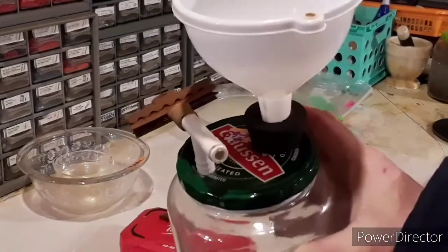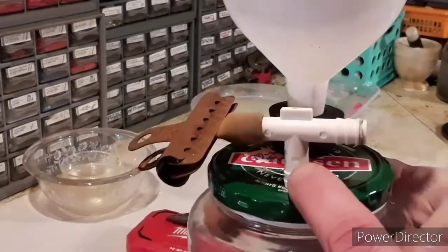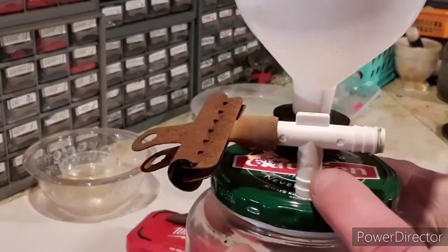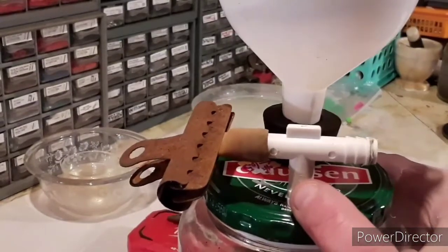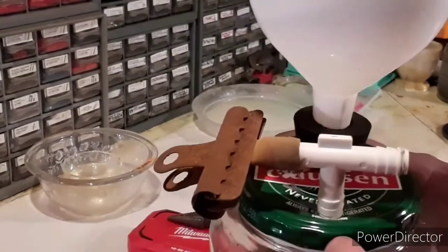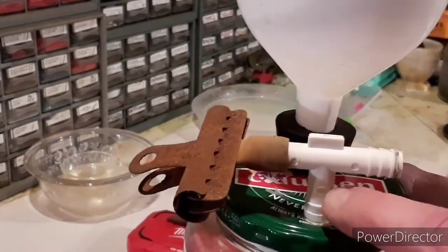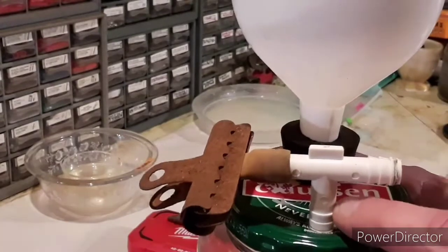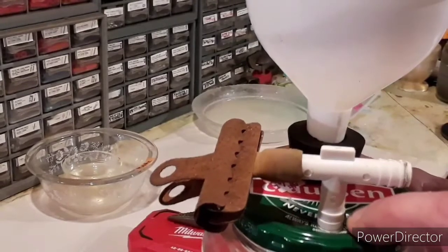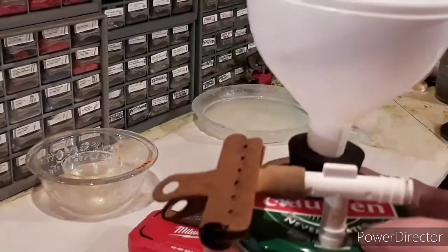All it is, is a pickle jar, and I drilled a hole right here in the lid. I had these high-density polyethylene T-joints already. I made the hole just big enough so that when these little flanges go down in the hole to the widest point of the first one, it makes a seal right there and it's airtight without anything else on it.